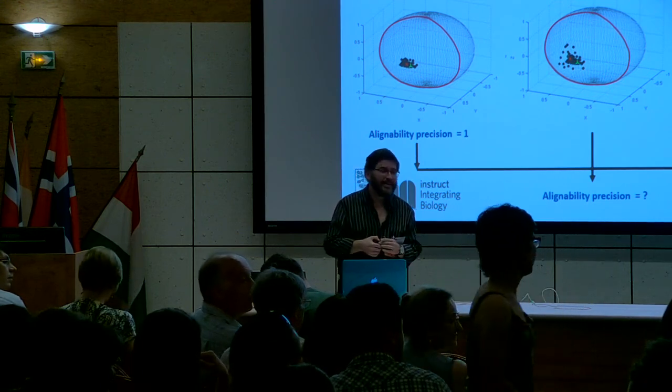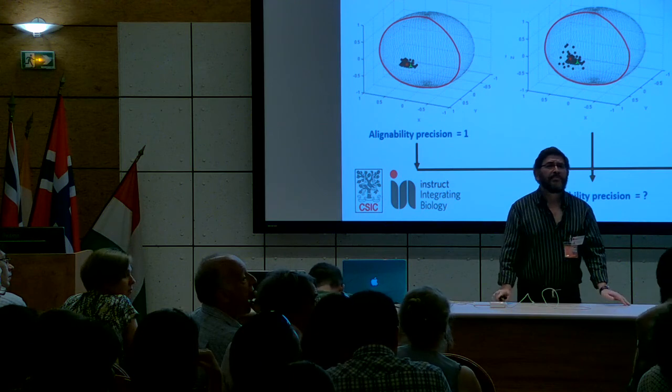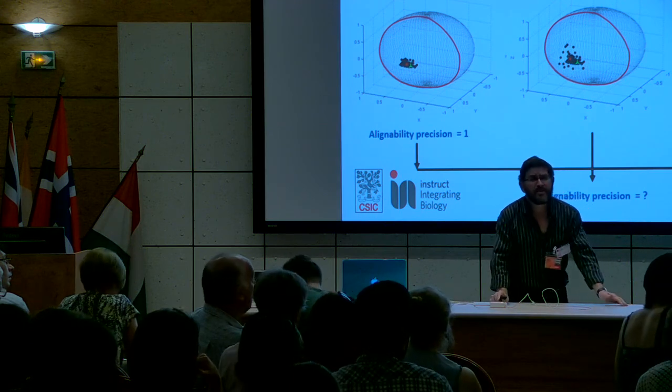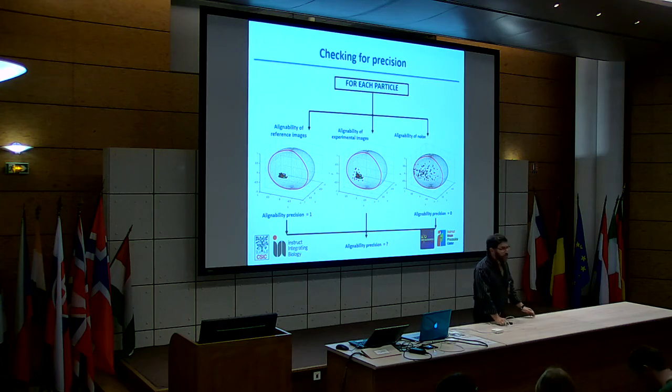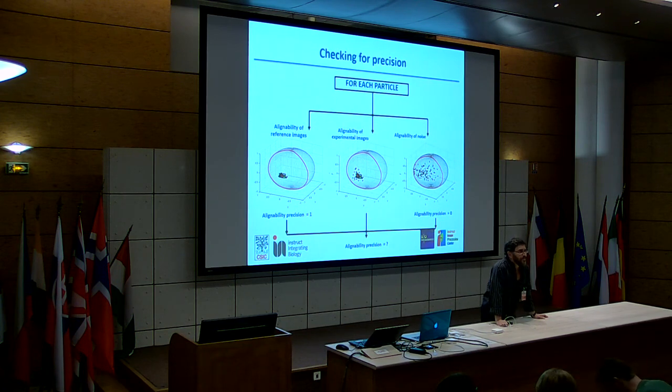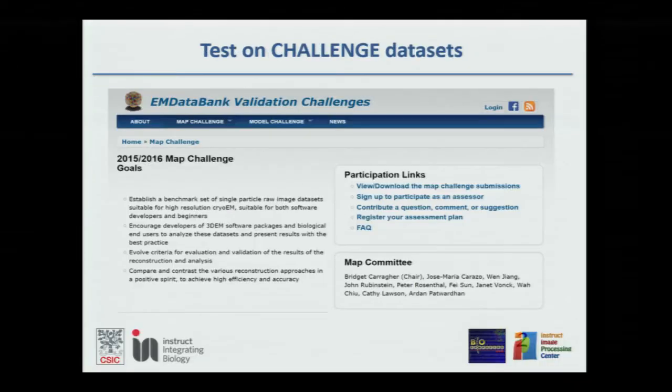About resolution. In crystallography, the concept of resolution is defined in a very univocal way. So it means that if I have a structure at 2.5 angstrom resolution, it means that I have measured the amplitudes at 2.5 angstrom. Maybe the model is wrong, but anyhow, that's the resolution. Do you think that in cryo-EM the concept of resolution is the same quantitatively?